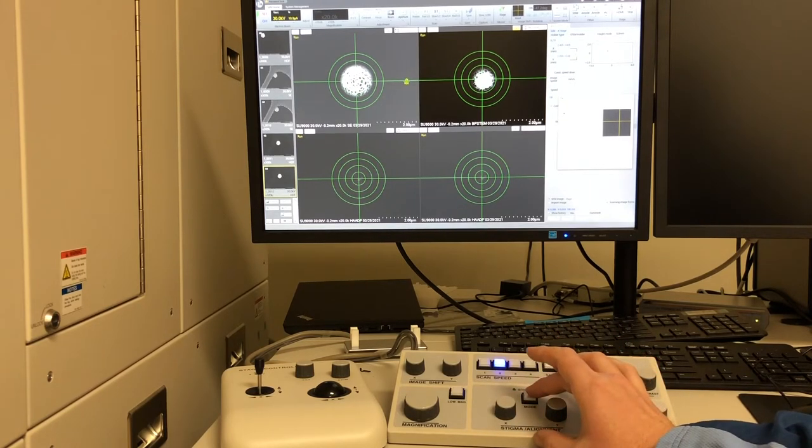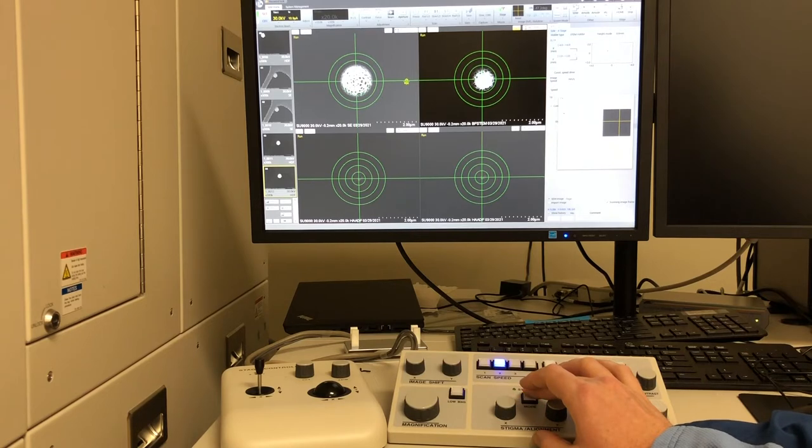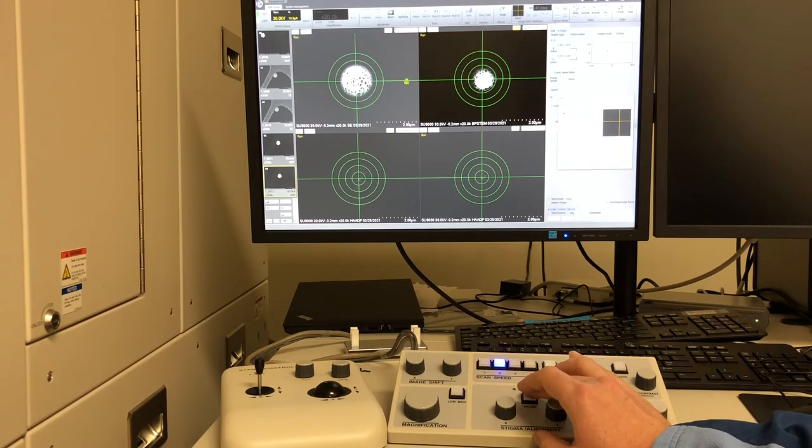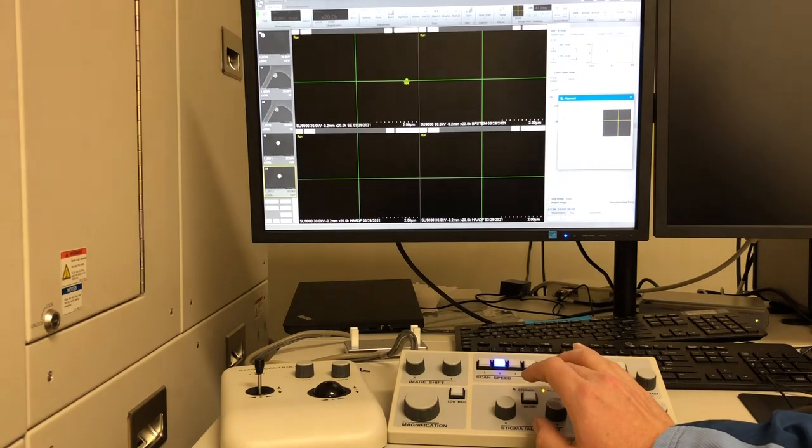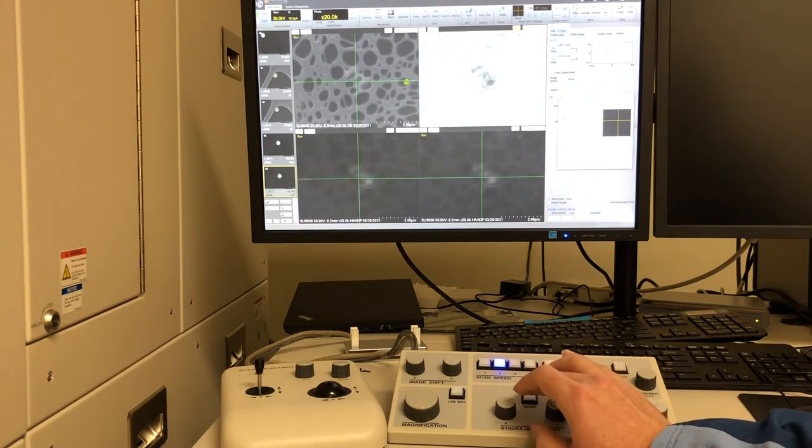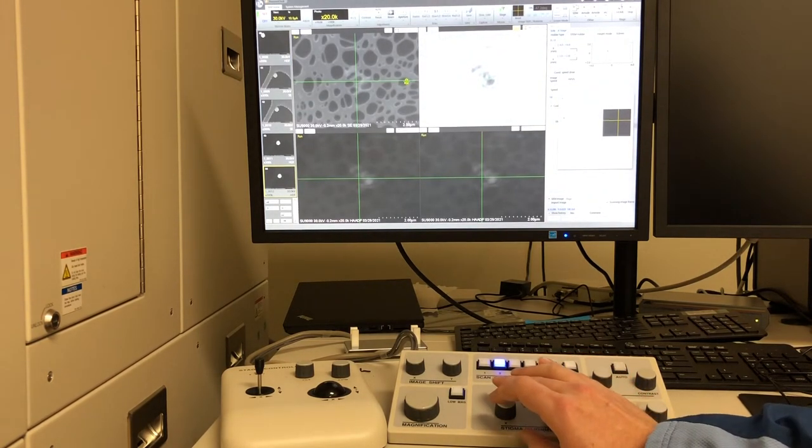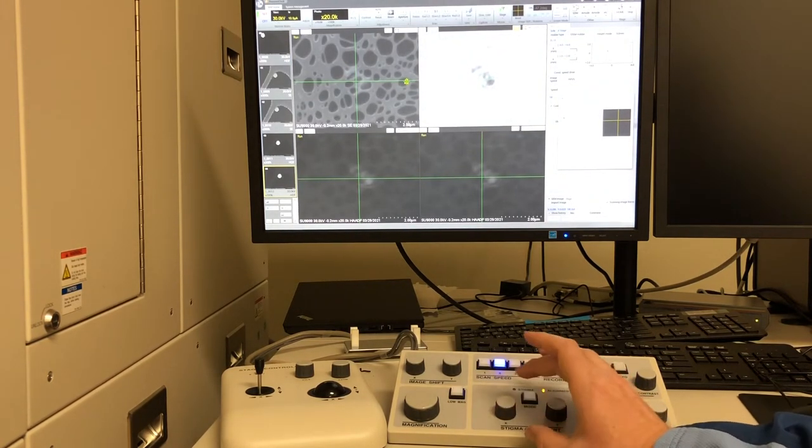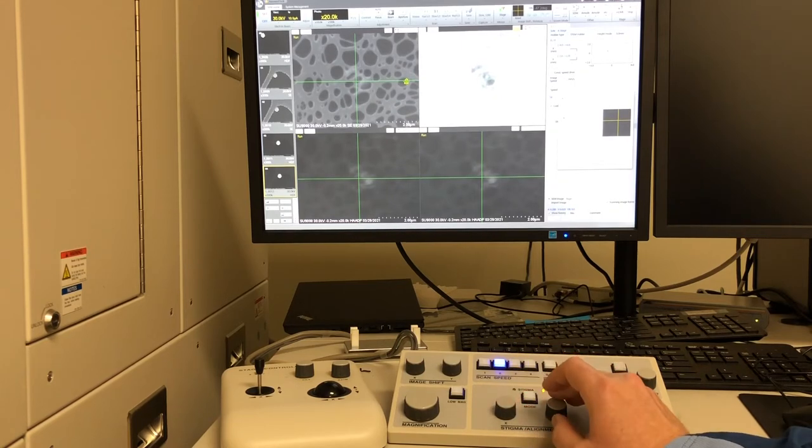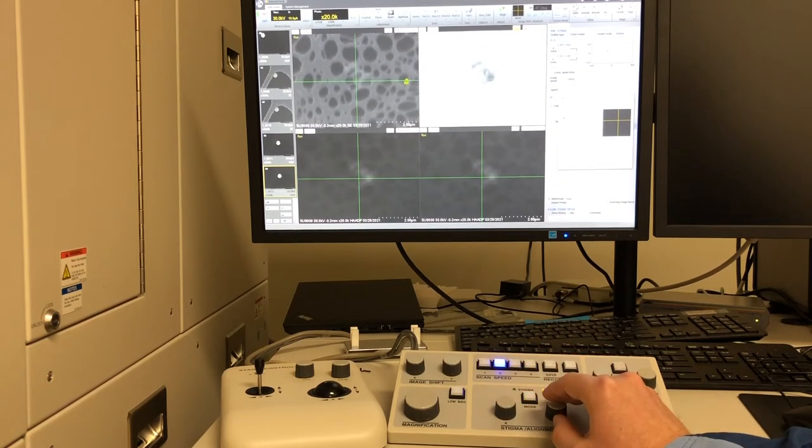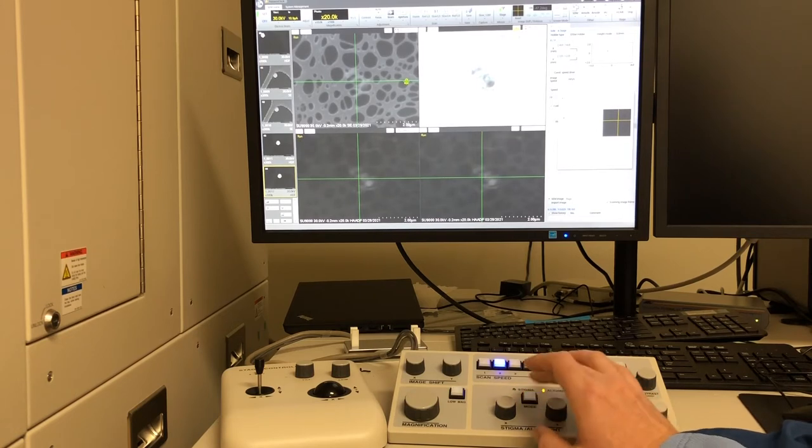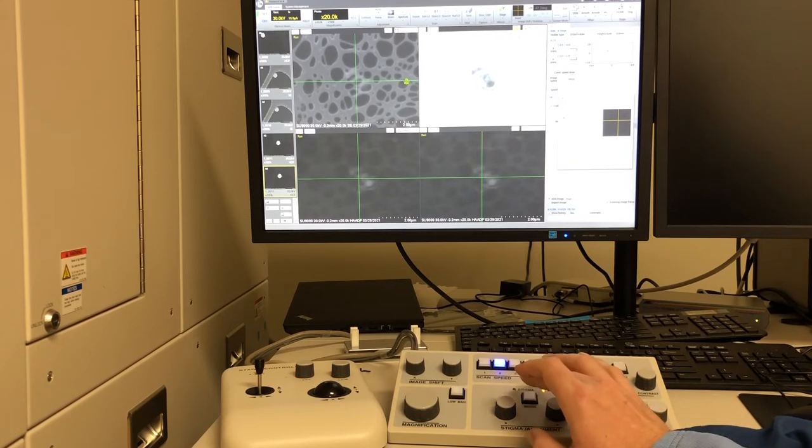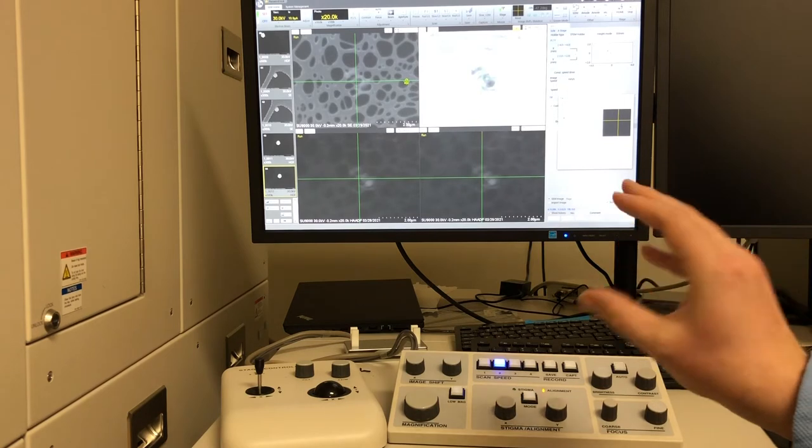Next, I'll hit mode, which will send me to aperture alignment. In this case, we want the sample to pulse and not move in any one direction. So it's moving up and down a little bit. So I'm going to fix that with the Y. Now it looks good. It's just pulsing in and out.